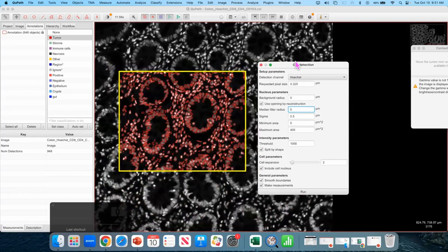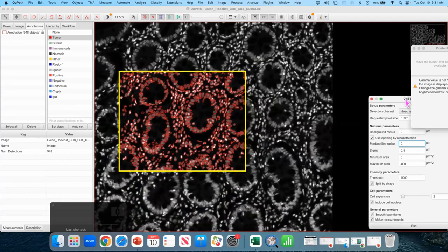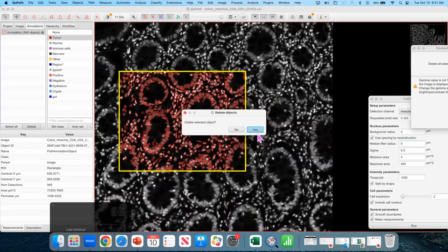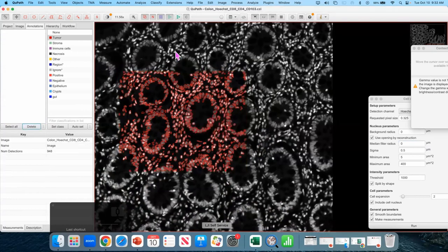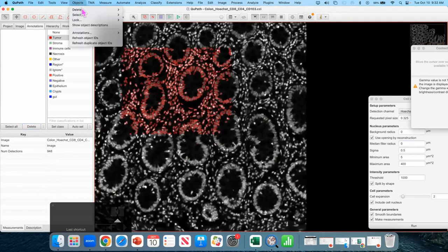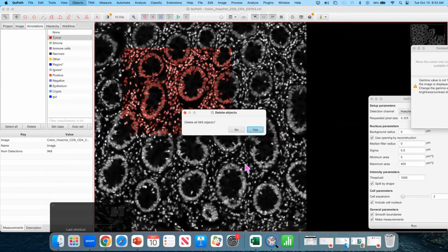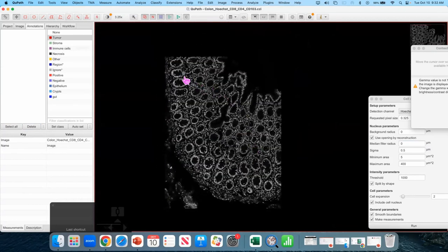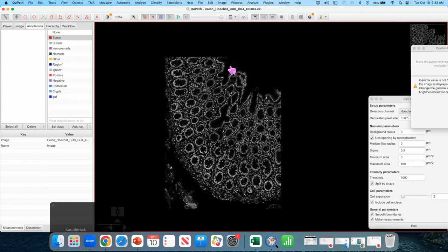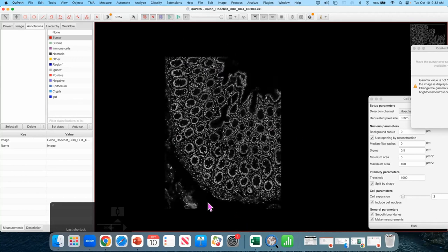Okay we're good. Okay once, move this detection move this window off to the side or you can close it. You know how to get it back and then delete this annotation. So I want to delete the object. I also want to delete the descendant objects. Nope I wanted to delete them not keep them. So because that was wrong I'm going to go to objects delete delete all objects. Yeah the yes and no are flipped. I do want this.